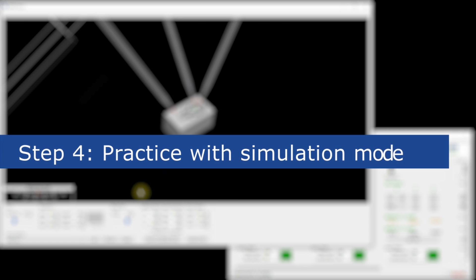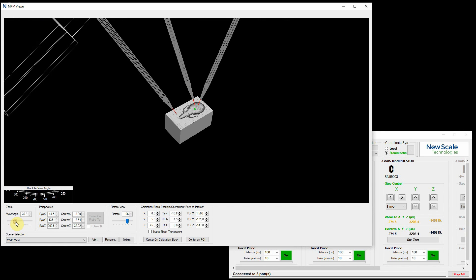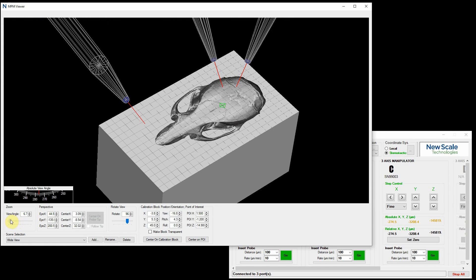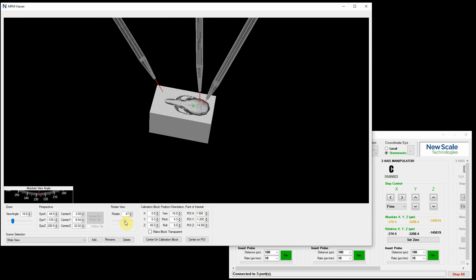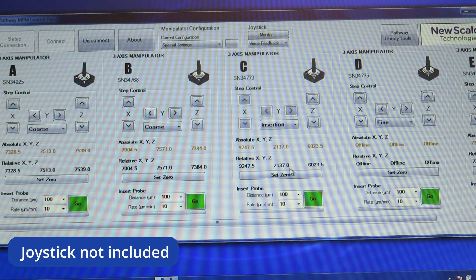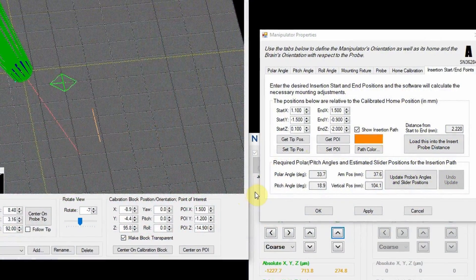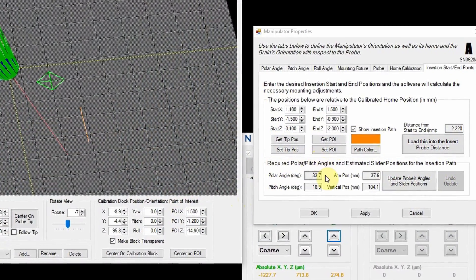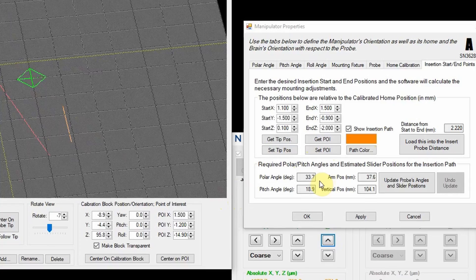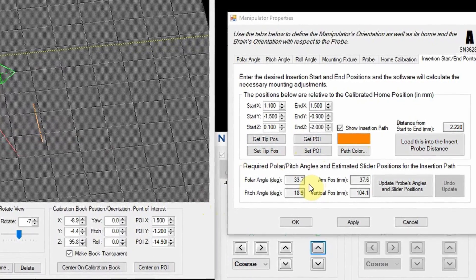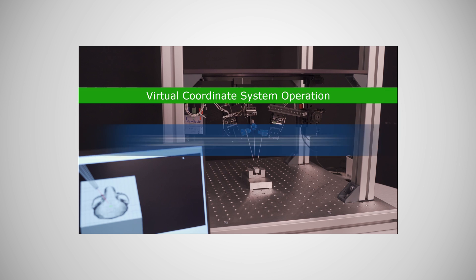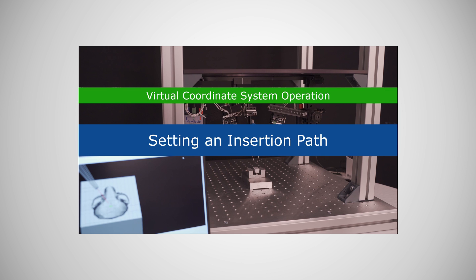Step 4: Use Simulation Mode to explore system capabilities and practice using the software. Even before your hardware arrives, you can use the MPM system simulation mode to learn and safely practice the best operation of all control features. The joystick can also be used in simulation mode. If you know the area of the brain you want to explore, you can enter the stereotactic start and stop coordinates from your brain atlas into the virtual coordinate system and run an experiment in simulation mode. To see this, watch Video 11, VCS Setting and Insertion Path.